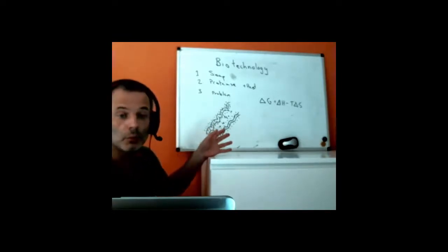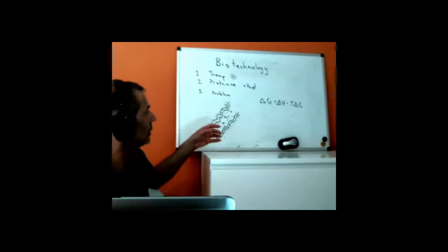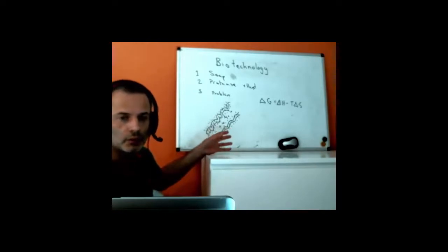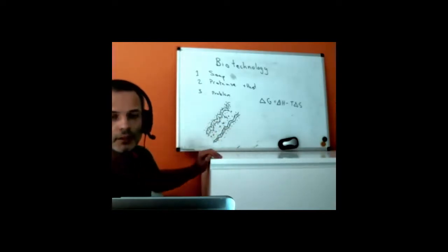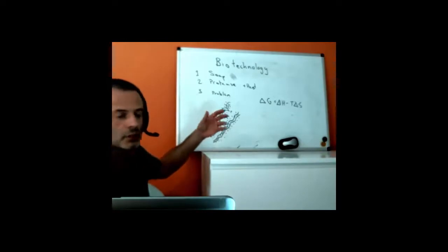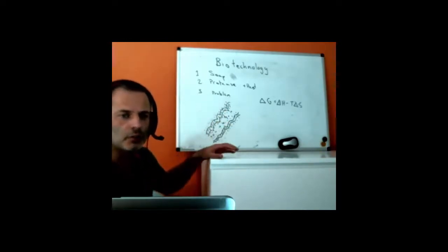It's slightly better in my experience if we use isopropanol, because isopropanol has more carbons on it and it's cheap, and it doesn't interact with any of the things that we don't want to destroy. The problem usually is if we want to retain a protein and we want to retain its structure, alcohols will mess with that because they will interact with the hydrophobic parts of the protein and cause it to unravel.